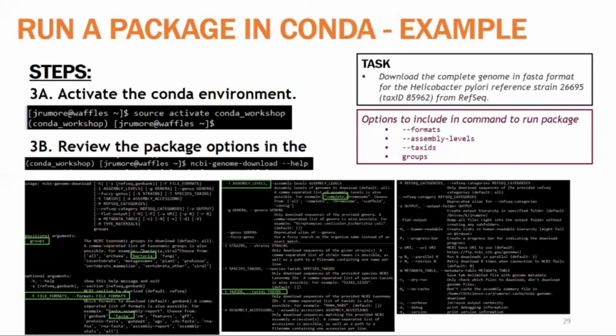Now, one thing you'll notice is I'm not concerned with including the section option in my script, which, from the tool documentation, tells the package what repository to download from, so GenBank versus RefSeq. I'm not including it because it tells me that the package will download from the default repository, RefSeq, and this is exactly what I want to do. So to avoid complicating my code, I'm going to leave that option out.